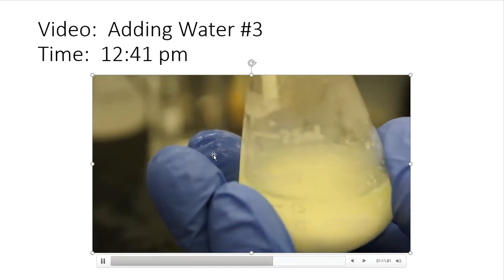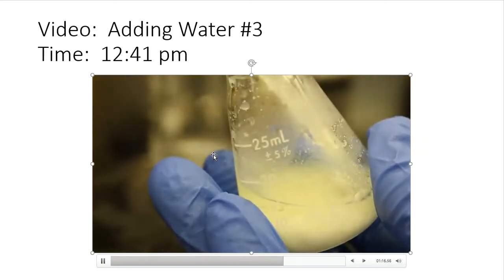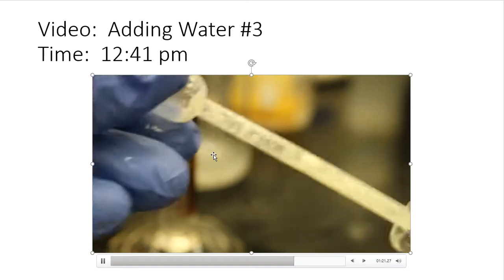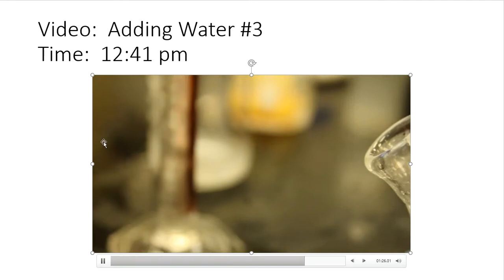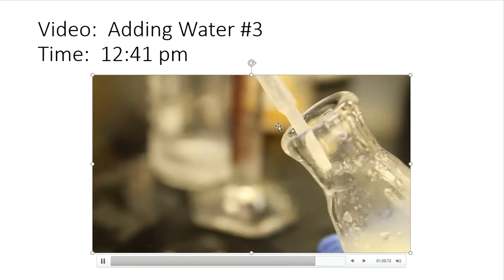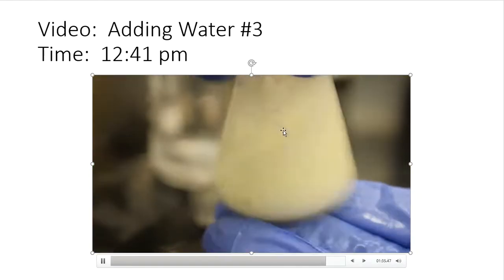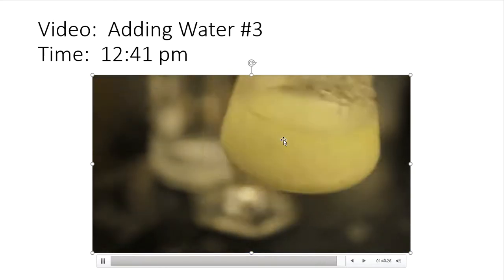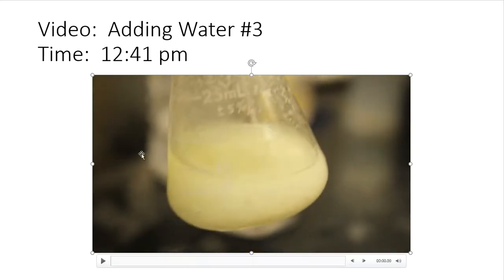So water is going to rinse, rinse, rinse, and push out product. But this product was already pushed out, so half of this job was already done. And I sucked some of it up in the pipette, so this extra little bit of water is just to rinse out everything on the inside of that plastic pipetter. I want recovery. I want to recapture and recover as much as I can in the procedure, so that's why I did that.